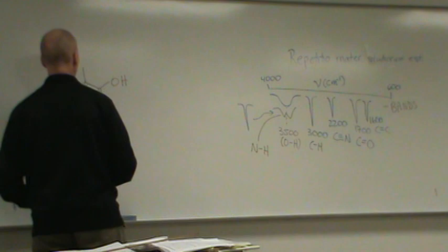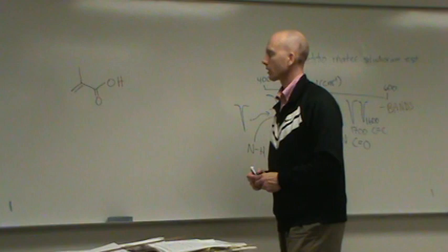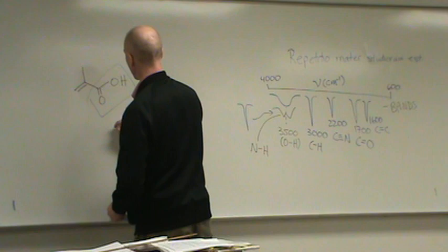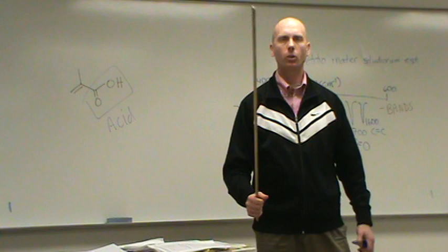Here's what this molecule is. And if you look, we have this functional group here, which is the carboxylic acid group. Okay? Carboxylic acids always stick out like a sore thumb.